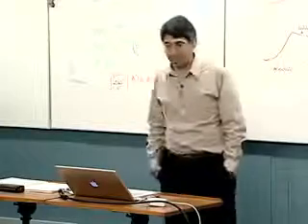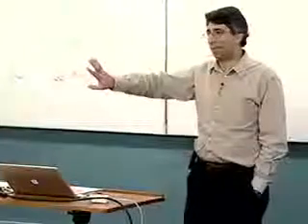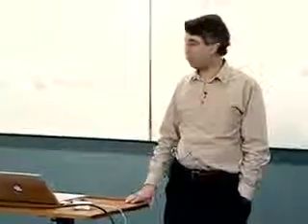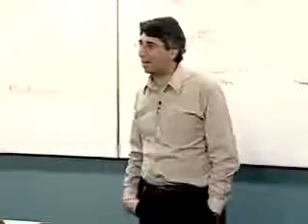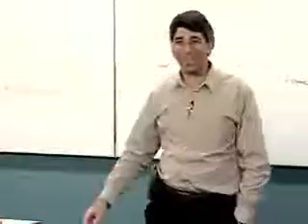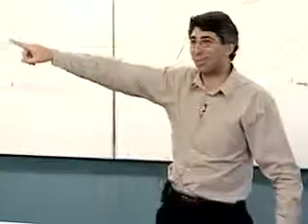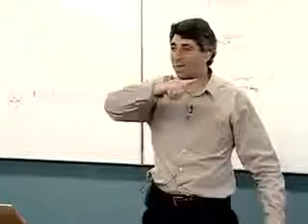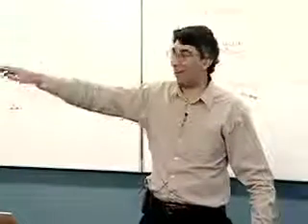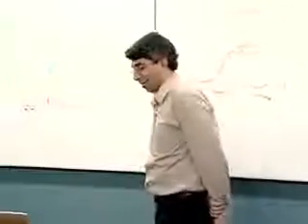The second thing is, although the manufacturer is responsible for what happens inside the box, you're sort of responsible for what happens outside the box. So, for example, you have your voltage and your current outputs, and you decide, and my students have done this actually, that you'd like the potentiostat on that side of the lab and your electrochemical cell on that side of the lab. Now, they're not scanning at 100,000 volts per second, but this is still annoying. You know, there's going to be IR loss in that line and whatnot, and you could expect that at some very high scan rate, things are going to mess up.